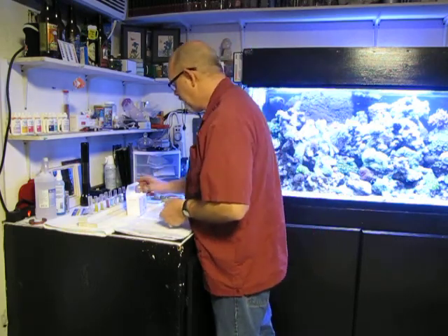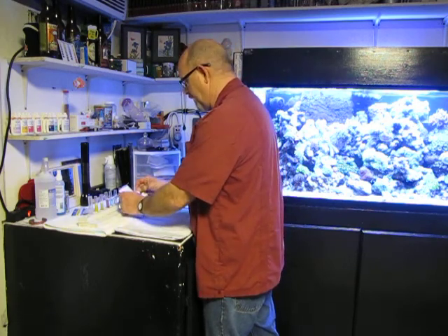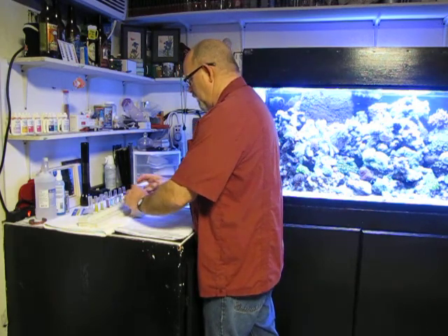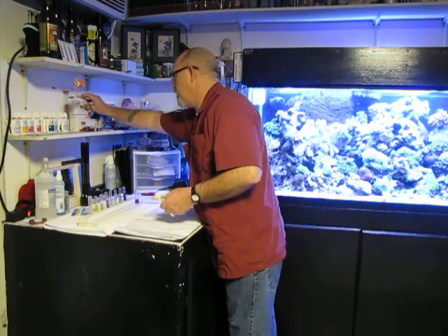So we take the six from reagent D and subtract it from the 33 from region A, which is 27. Then we multiply 27 by 50, and that gives me a magnesium reading of 1350. A little high — about 100 off — but it's not a big deal. I've got plenty of coral and they love to eat it up.